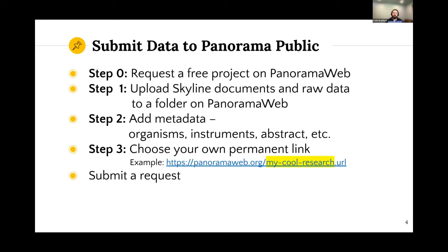You can just fill in the required portion, and I can show you an example of what that looks like with just the generic. And then you can also go above and beyond and put in more customization to add visualizations or additional information, or make additional files available. And then choose your link and submit the data to become publicly available.